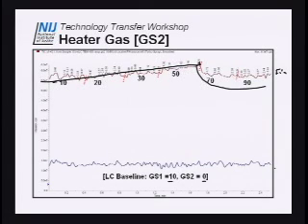I think this area right here, and this is just me talking, the source becomes very turbulent with a lot of gas in there. But you can see that makes a difference. Not that much difference between 20 and 50. We run it somewhere in the 50 area.